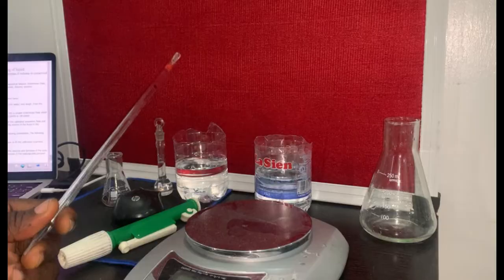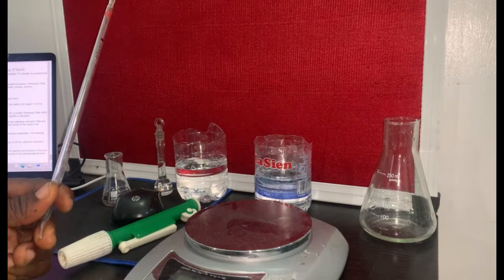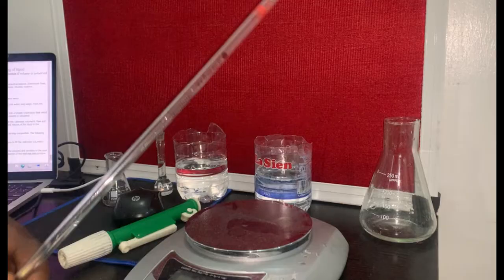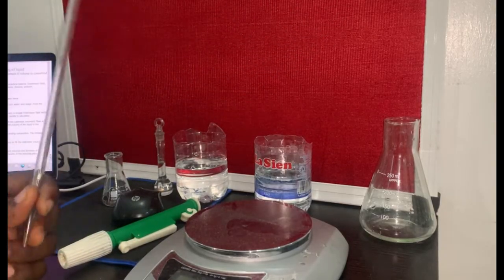We carried out our calculation. We had to weigh the flask when it is empty. We filled it with water, and then from density equals mass over volume, the volume will now be mass over density. So we got the volume of the flask.